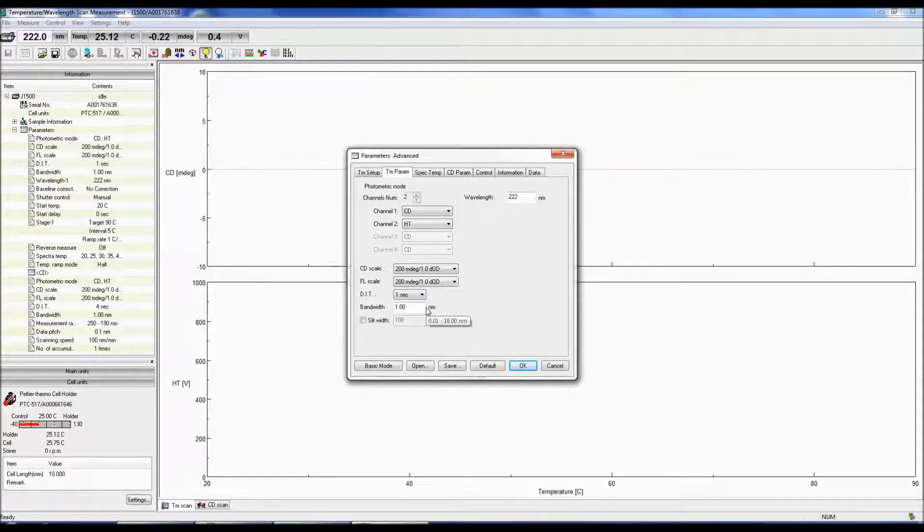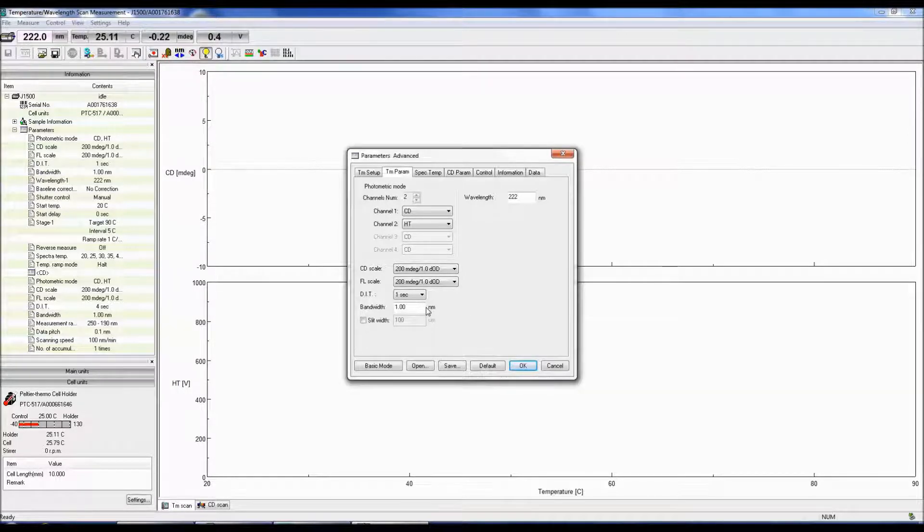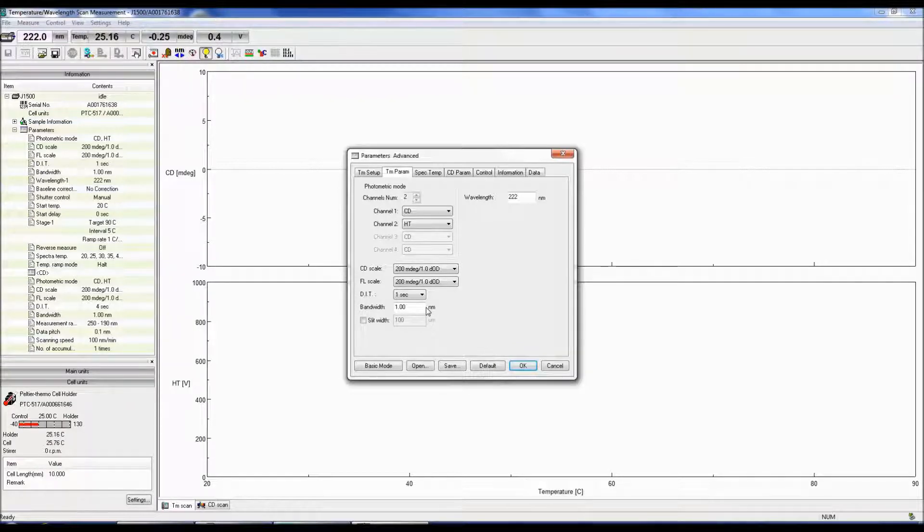The bandwidth determines how much light reaches the sample. The smaller the bandwidth, the less light throughput and the lower the signal to noise, but you can achieve better peak resolution. However, since CD peaks are broad, 1 to 2 nm bandwidth is fine.